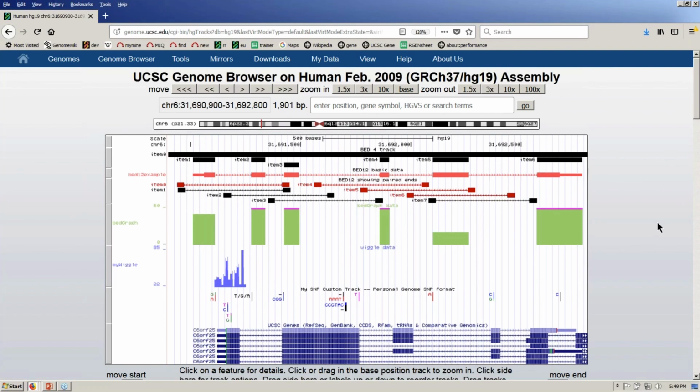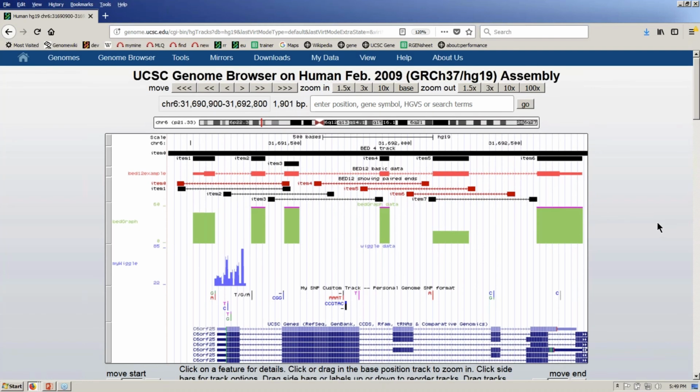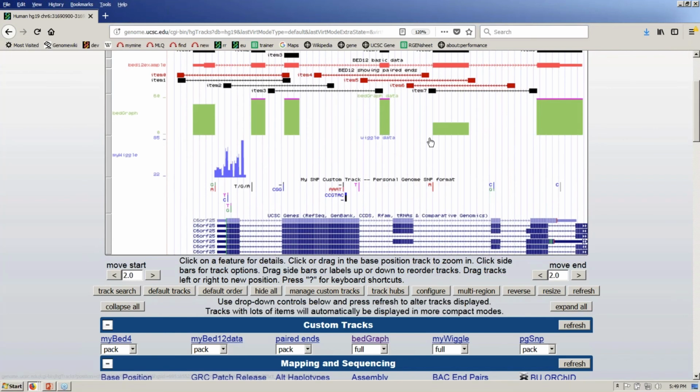And it can be condensed even further into a bigWig format, which is a binary format. And we have software for that, which you can download, and you can get instructions for how to do that from the link that I showed you via the add custom tracks location in our documentation. The downside to that is for people who do not have easy access to a URL for loading those browsers, you need to find a place to put it, such as CyVerse and eventually Dropbox.